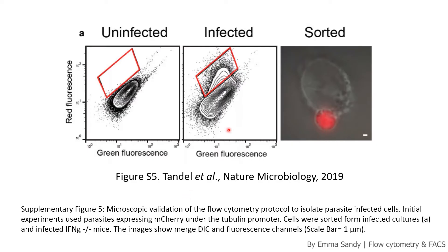First we've got a contour plot. Here the authors were sorting for cells infected with a red fluorescent parasite. On the y-axis we have red fluorescence, which the infected cells will score higher for — but remember that uninfected cells will also have some background autofluorescence. You can see that the gate is drawn on the uninfected cells in the red box, then copied over so that any cells inside the gate on the infected graph are the ones infected with the red parasites. These infected cells have been sorted and you can see under microscopy that the red parasite is present.